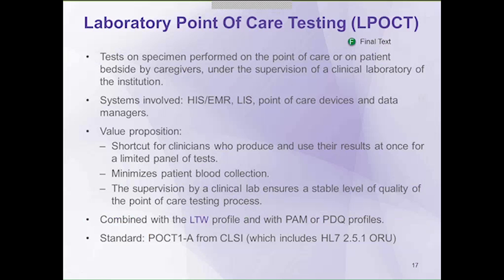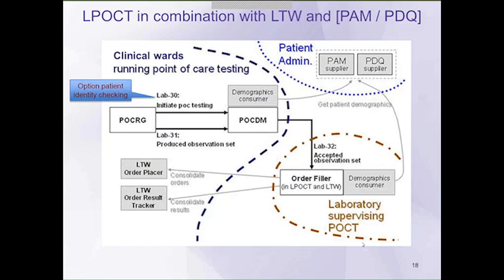This is a standard from CLSI that we're using, but it still also uses HL7 2.5.1 as a basis. Here's what that looks like.